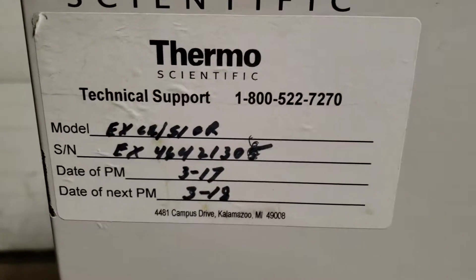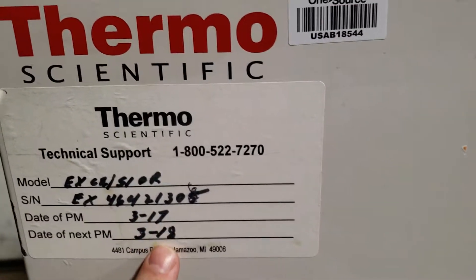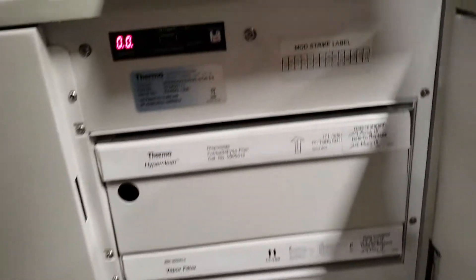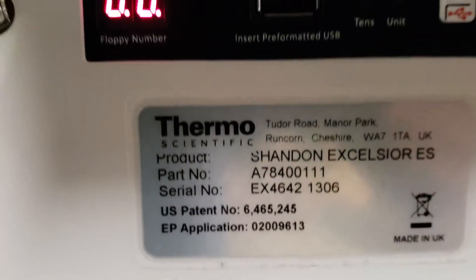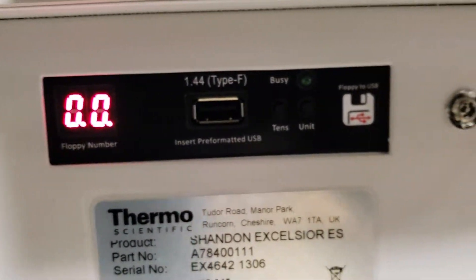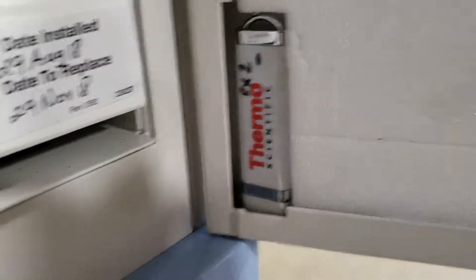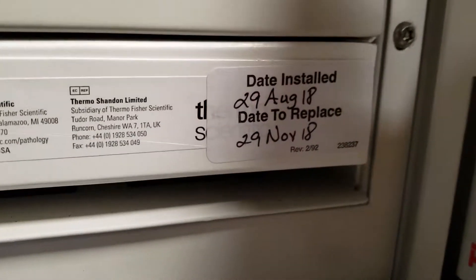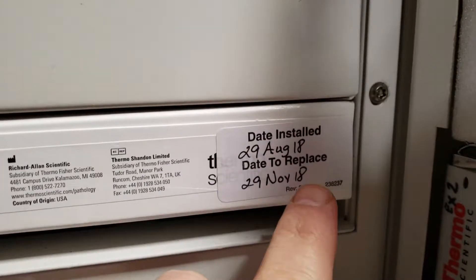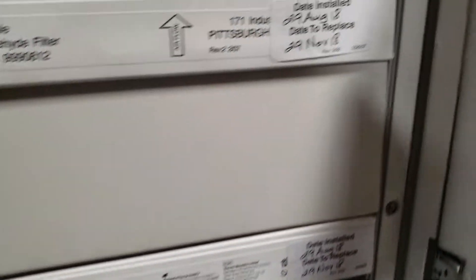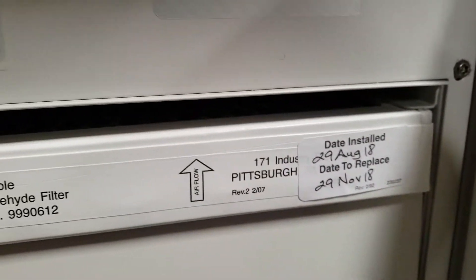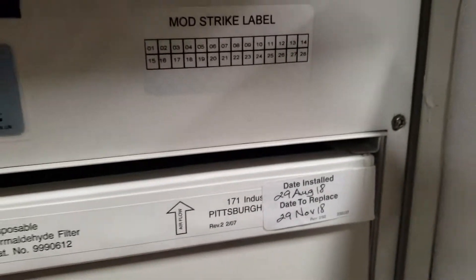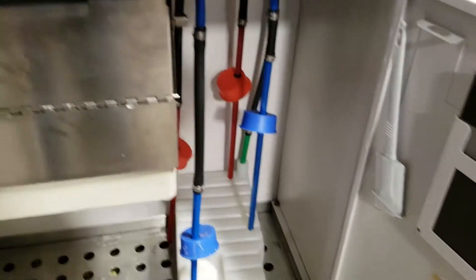The next PM date is 3/18, when they took it out of service. Here's the part number and USB input, probably for updates. There's the USB keycard. This shows November 29th, 2018 for vapor filter replacement, same with the hyper clean. Those are probably still good, or actually maybe not.